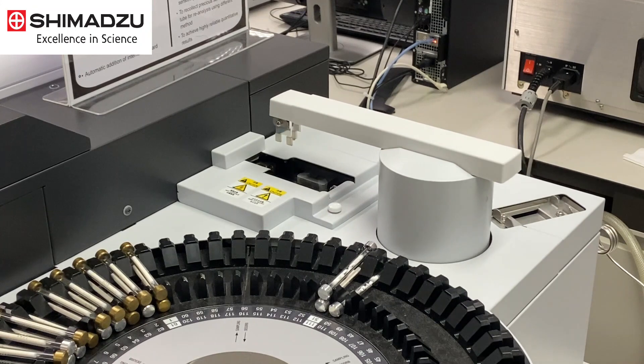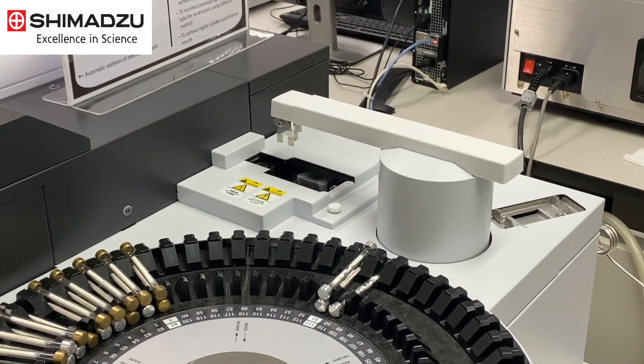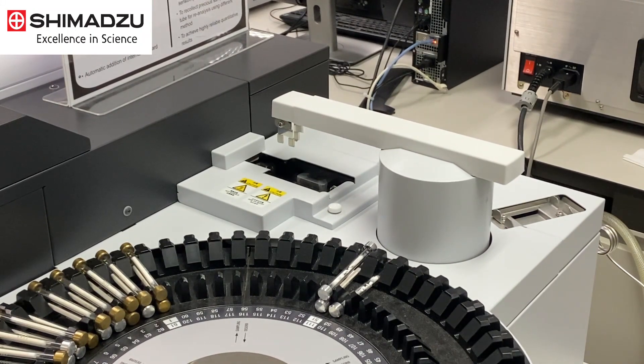After heating and extraction were completed, the auto-sampler arm returned the TD sample tube to the tray.